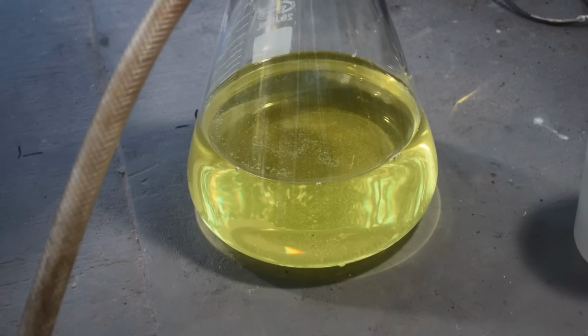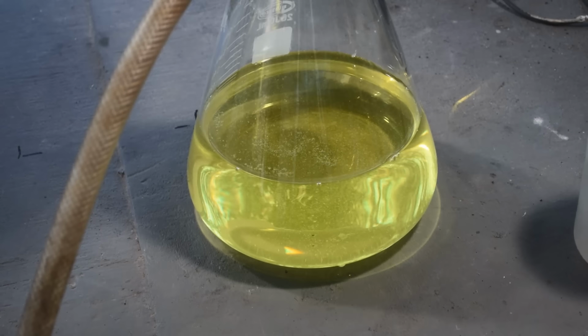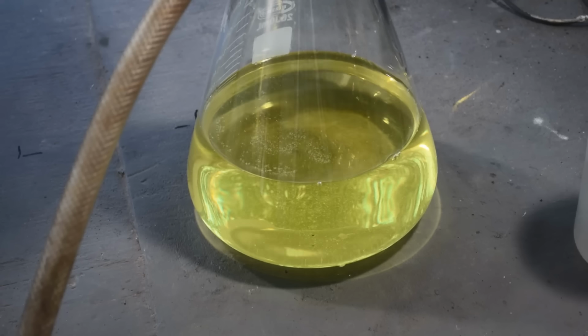But look what's happening down here. We got a scum of crystals forming on the surface again. Those did not come through the filter. They have formed since filtration. So, what do I want to do about that? I'm more and more convinced that those are lead chloride crystals.